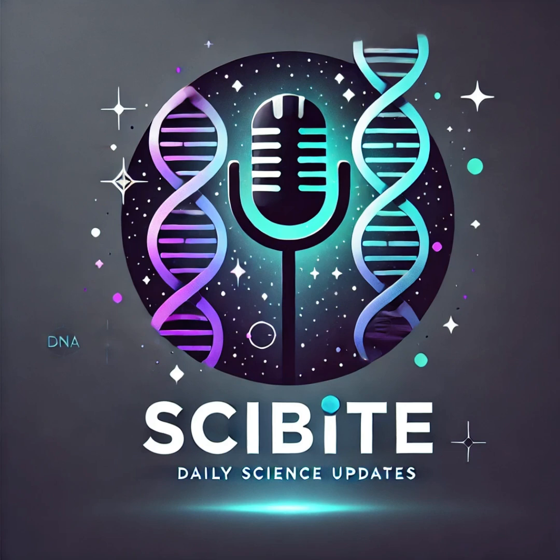Exactly. The ability to really see things at the nanoscale is completely revolutionizing material science. Like finally having the tools to understand the blueprint of a building. You can see each individual brick and how it contributes to the overall structure. That's a great analogy. And the technique we're talking about today is XLDOT, or X-ray linear dichroic orientation tomography.